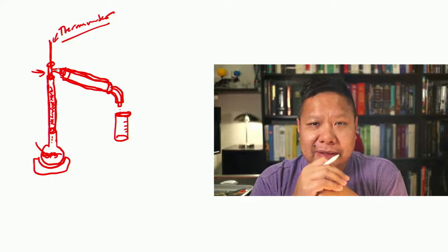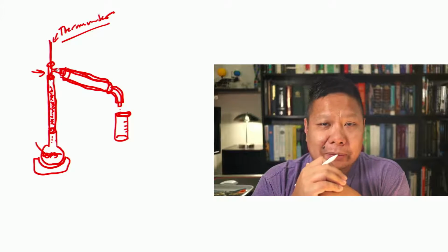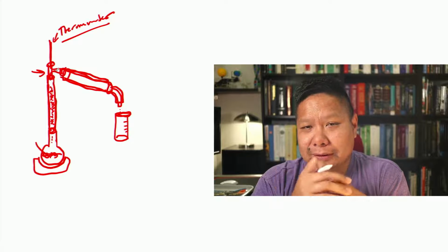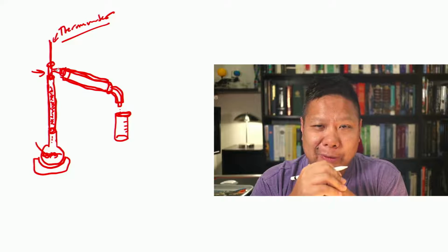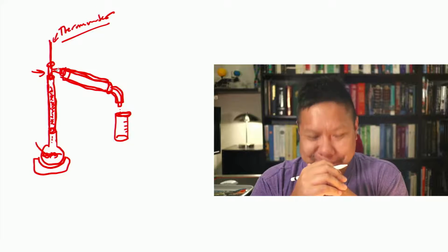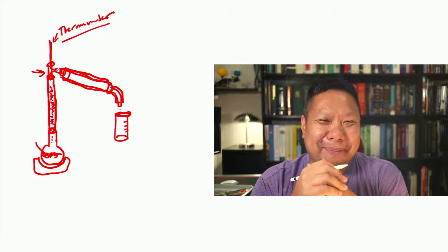I know you're doing this virtually, but one day you might want to distill some alcohol. But you need to be very careful when you install the thermometer in the thermometer adapter, because I had this friend, well, he's not really a friend, he's an acquaintance. When we were in organic lab, he was installing his thermometer into his thermometer adapter.